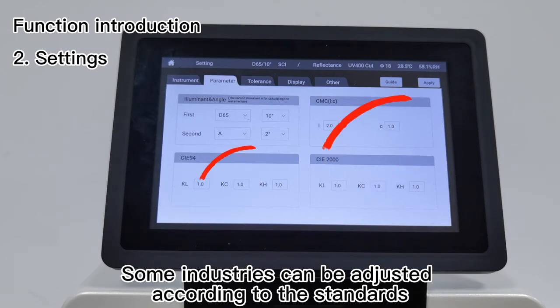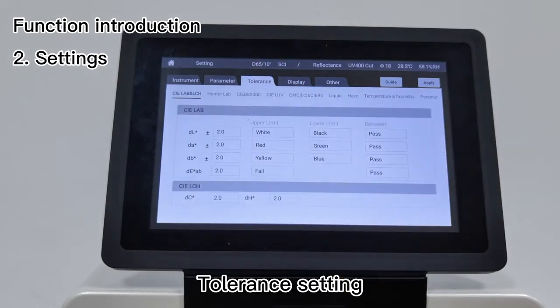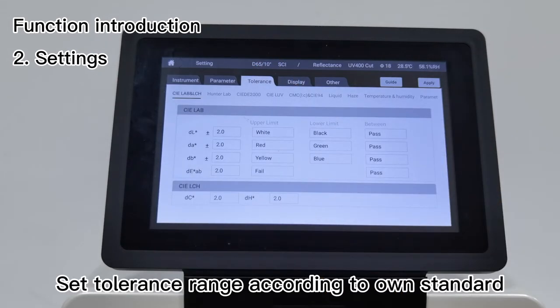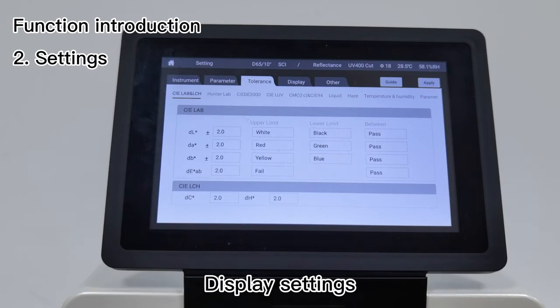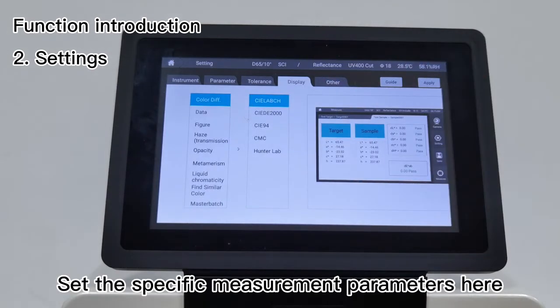Tolerance setting allows you to set tolerance range according to standards.